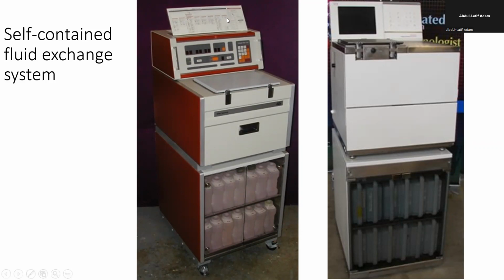So that one too is digitalized. You set which one should go first. All of them have labels, so they have numbers there. You set, this is alcohol, this is xylene, this is molten wax. And usually, as I mentioned to you, the molten wax, because it has to be in the fluid state, is always hot. I mentioned that it is about 3 to 5 degrees above the melting point of the wax, just to keep it in a fluid state.